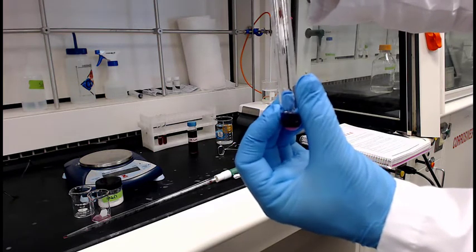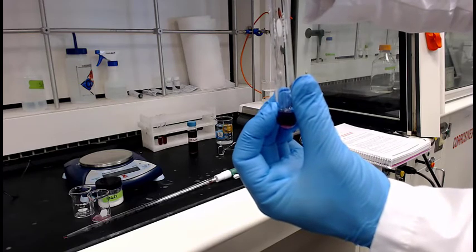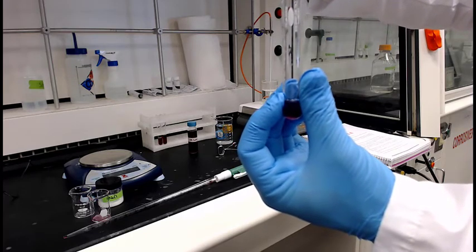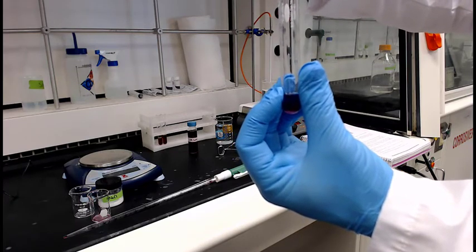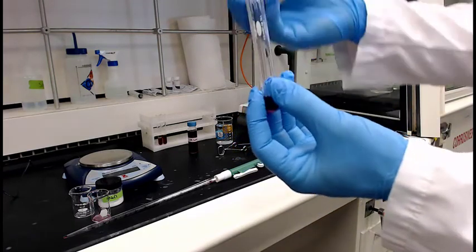But we'll see if it works, see if it pushes the reaction. It looks like it is. Let's see it getting, yeah, it's a good strong color change. That's good.